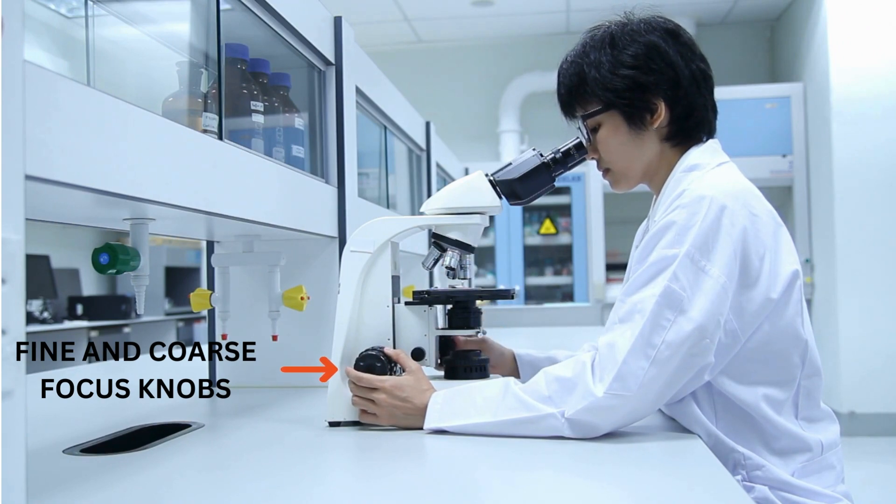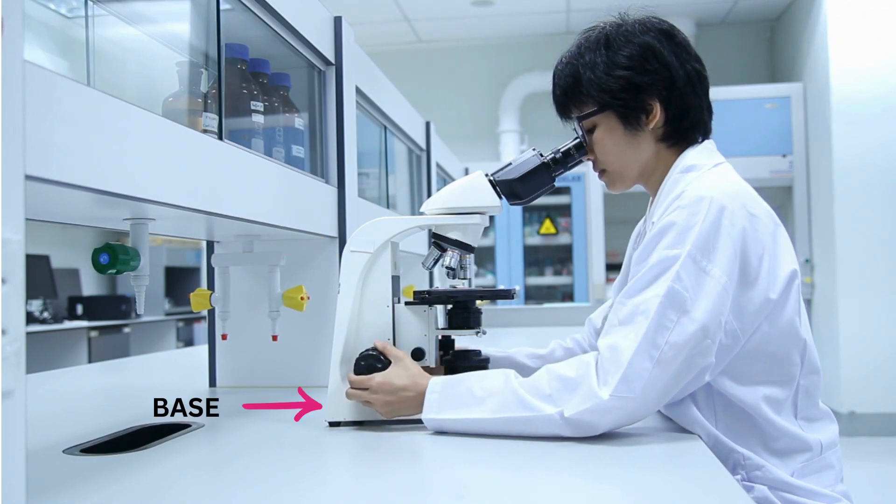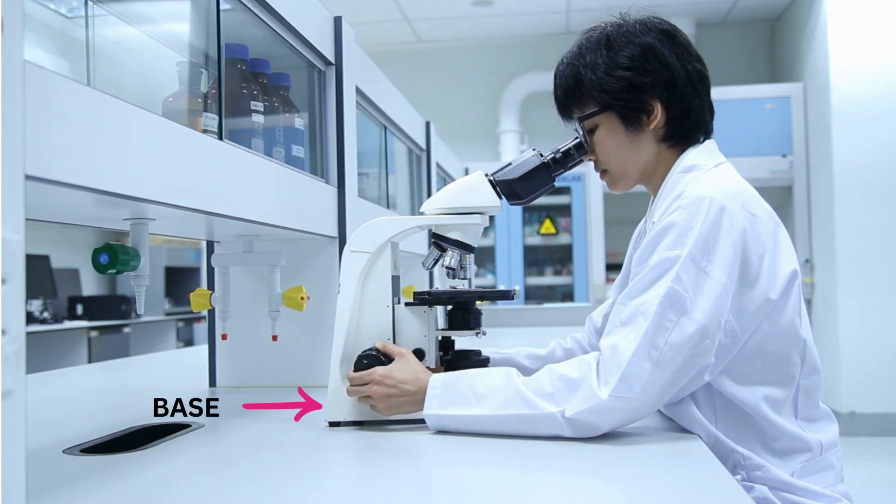Arm. The arm is the vertical support that connects the base to the head of the microscope. Base. The base is the bottom part of the microscope that provides stability and support.